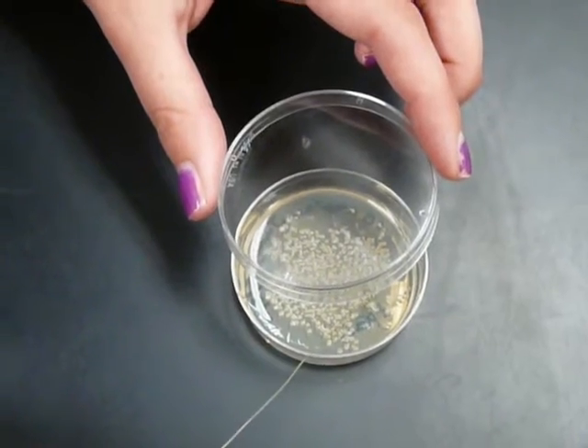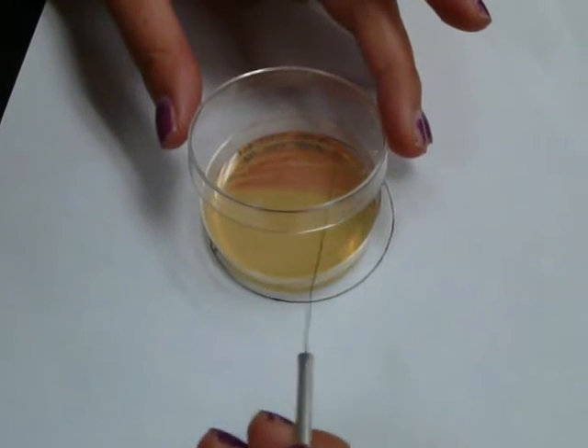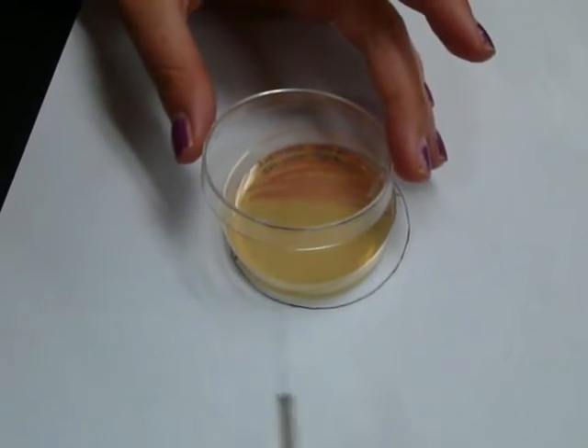Take a single colony off of your stock plate of bacteria. Drag the loop lightly across the plate — lightly enough so you're not puncturing the gel, but hard enough so that the bacteria is being deposited.